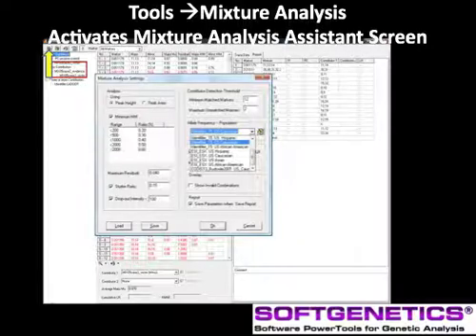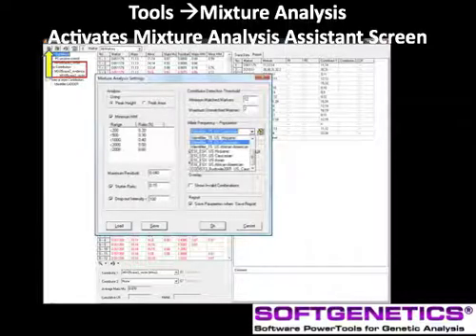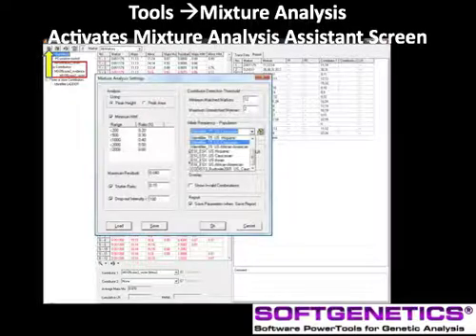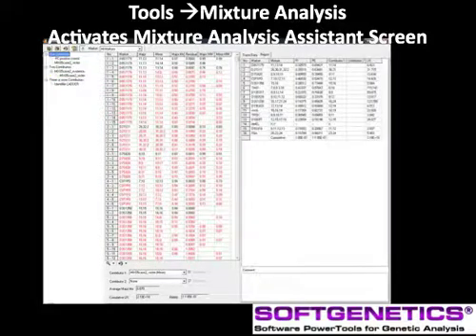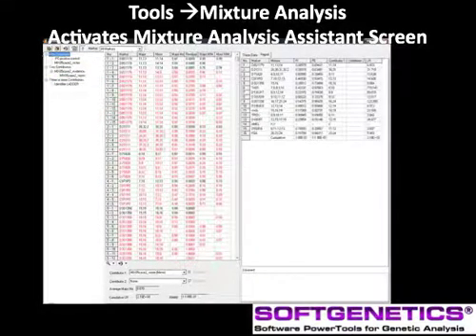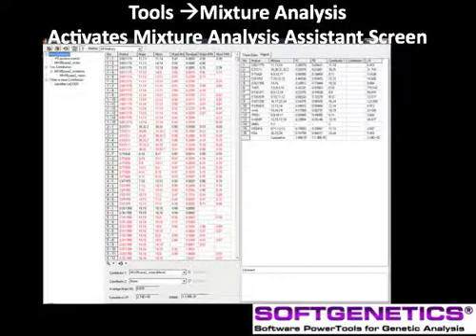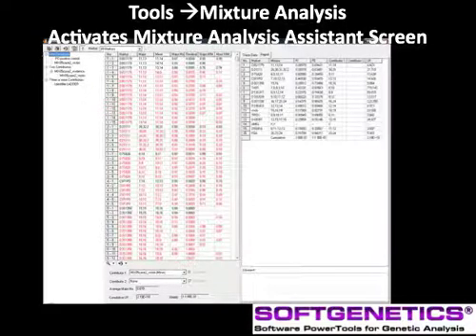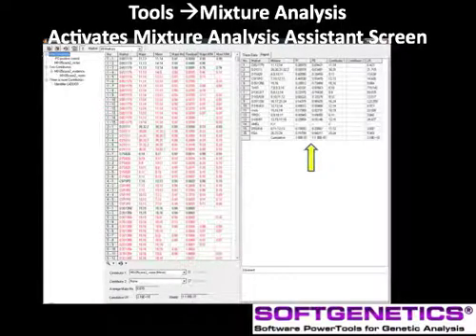When the allele frequency table is selected, the mixture calculations are displayed on the right side of the screen. Published guidelines for mixture analysis recommend viewing all possible allele combinations. These are displayed in the middle report table. The red font cells are allele combinations that do not agree with the mixture parameters selected. To view only the black font combinations that are in agreement with all the mixture parameters, click on the far right icon.